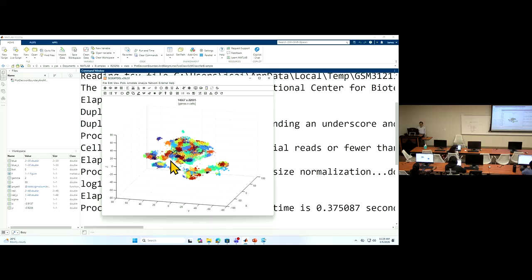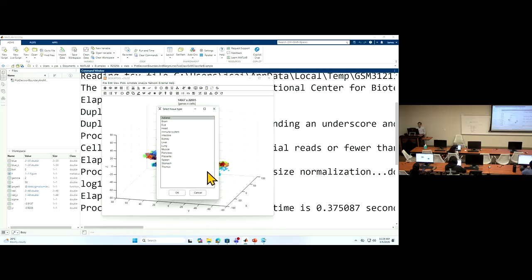If I say yes, you will find these predefined organs and tissues. I need to find, there's no skin, so it's very limited. Which one should I use? Use muscle? Use brain to annotate your skin?